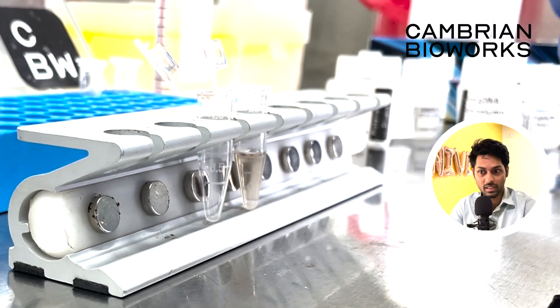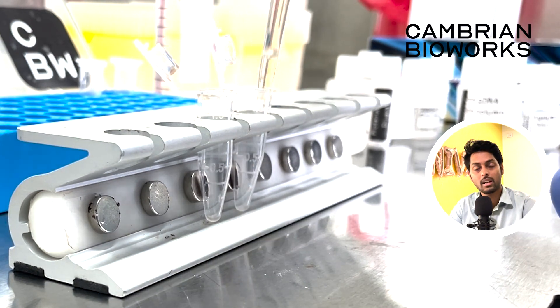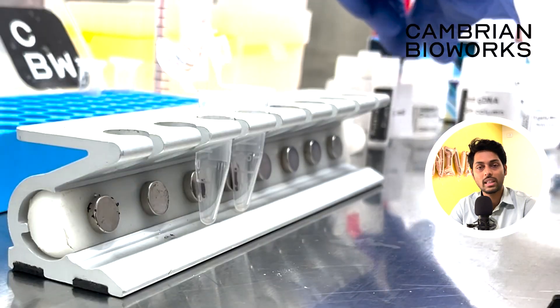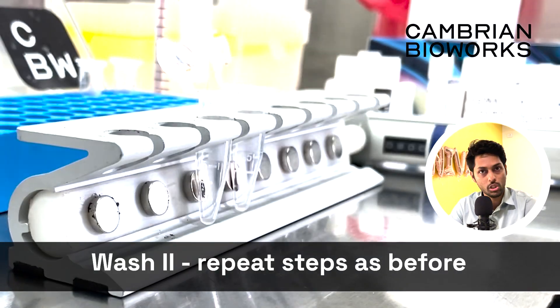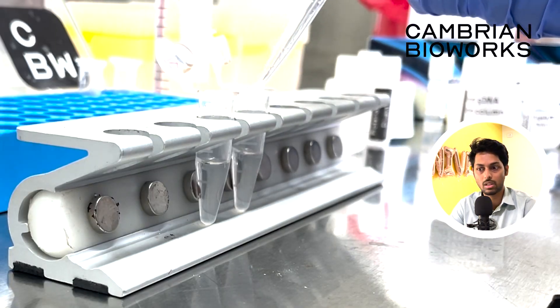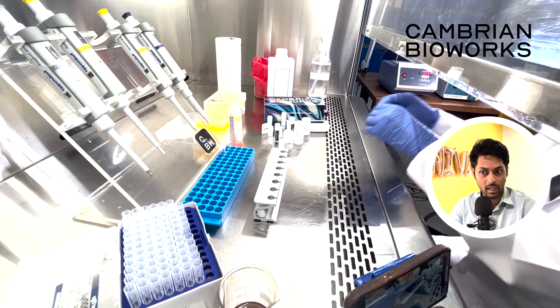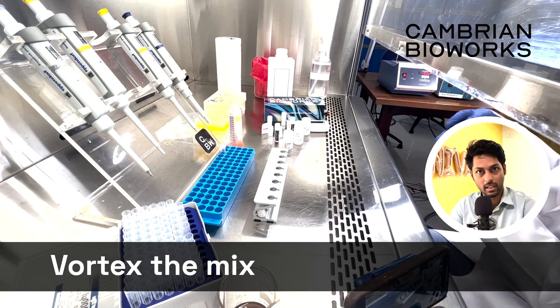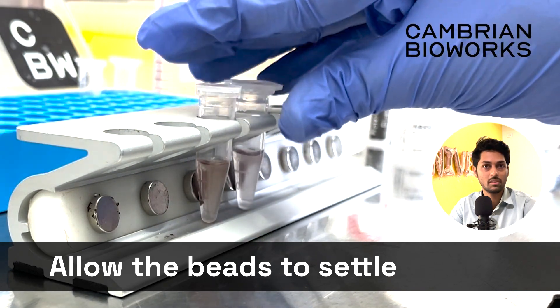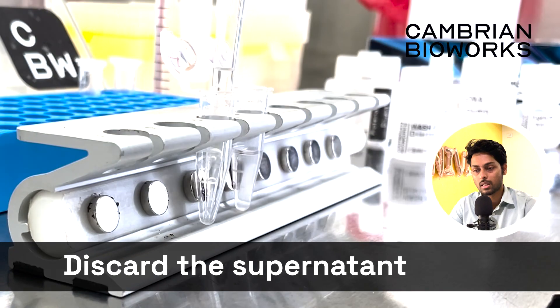Once that is done, ensure that the beads settle back down on the magnetic stand. Don't rush this step — as we're showing in the video, this is just for presentation purposes, but allow it to settle naturally at its own pace. It takes just about a minute or two. Once that is done, remove the supernatant. Wash 2 is exactly like Wash 1 in terms of steps: add 600 microliter to the settled beads, vortex thoroughly, place back on the mag stand, and allow the beads to settle. Make sure your supernatant is very clear by this point, meaning all the beads have settled and you're removing the impurities.